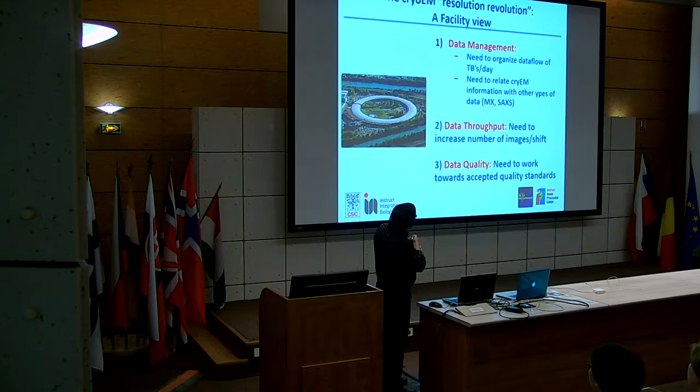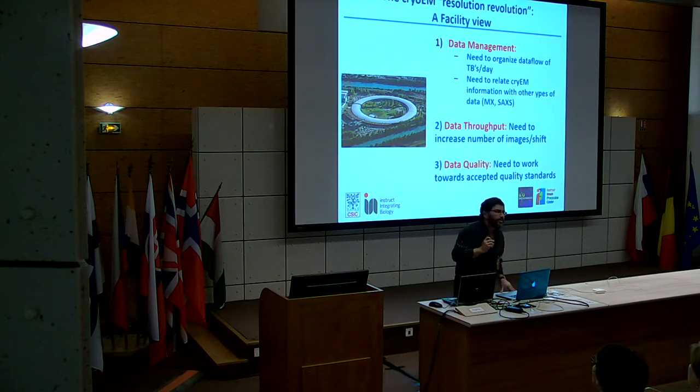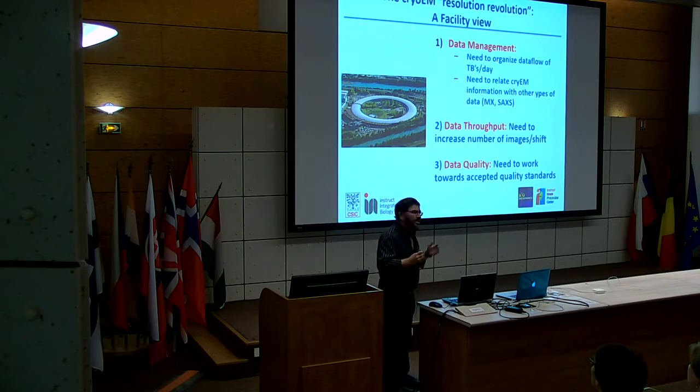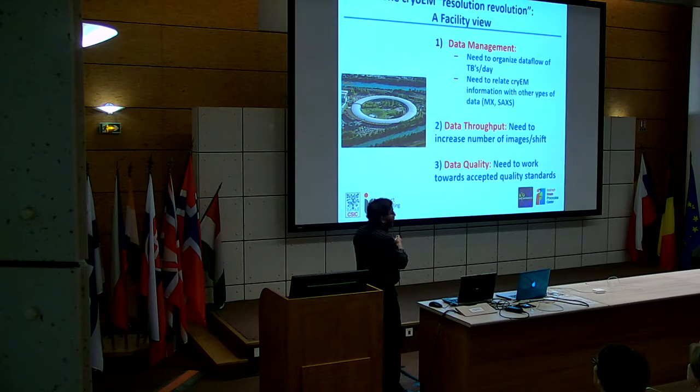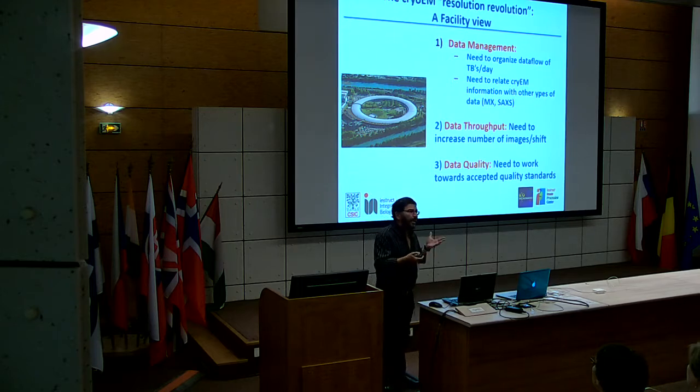You can say now electron microscopy is delivering terabytes per day. Yes, but the introductory talk of this workshop was telling you that this synchrotron has 40-something beam lines, and each of them was delivering also a lot of data. Terabytes or not, but a lot of data. So really, for an organization, it's very important how you manage that data.